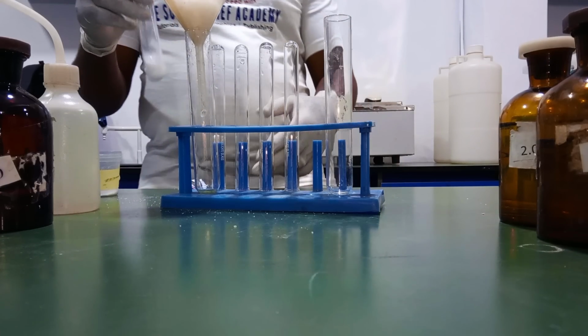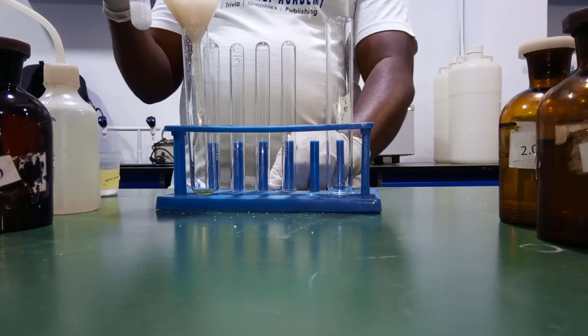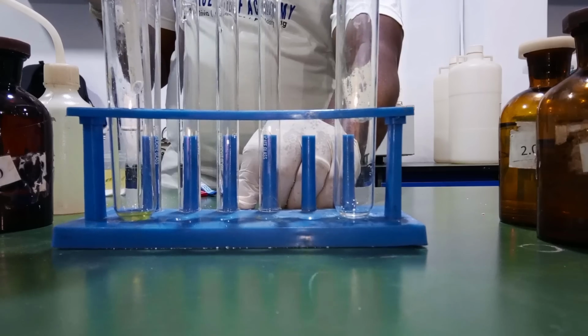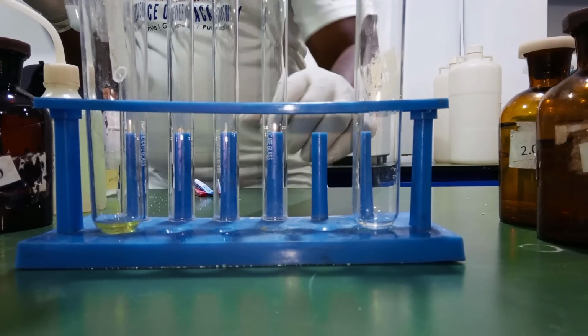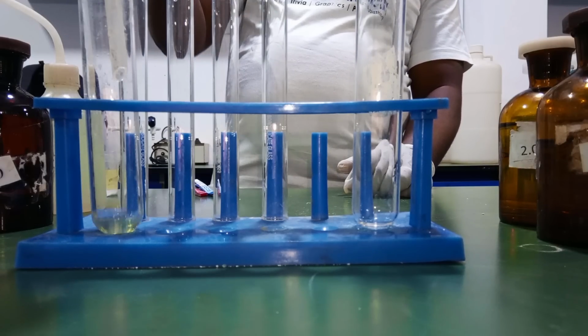You can see it's dropping. You can take it closer. You can see the filtration is taking place. Right? Good.